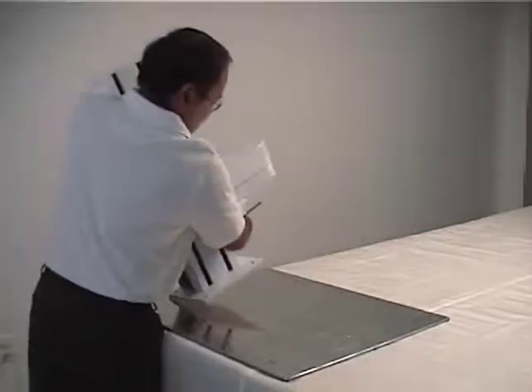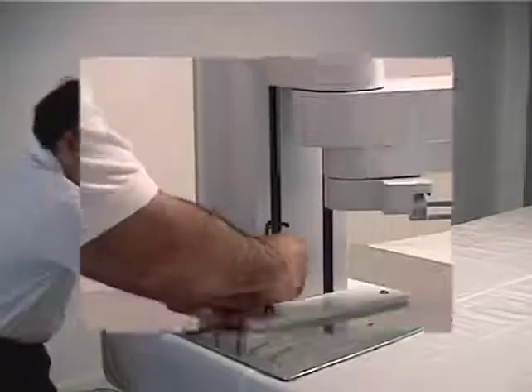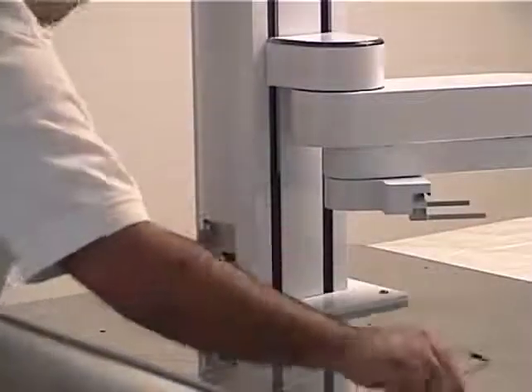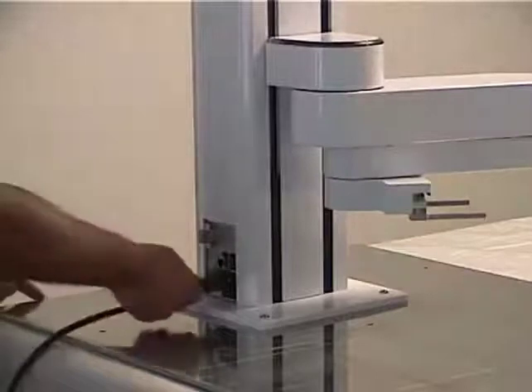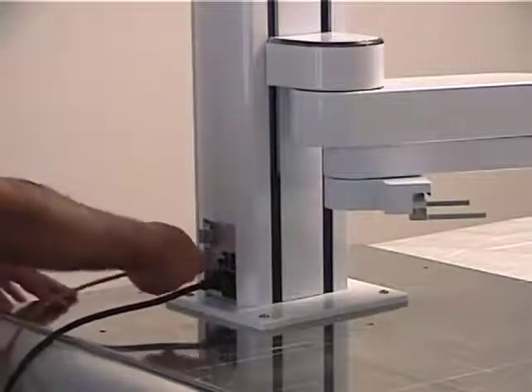This robot is extremely easy to set up. It is lightweight — a single person can lift it onto a table or a machine base — and it is easy to mount. All you need to do is plug it into standard wall power and an ethernet connection for communicating with other devices.